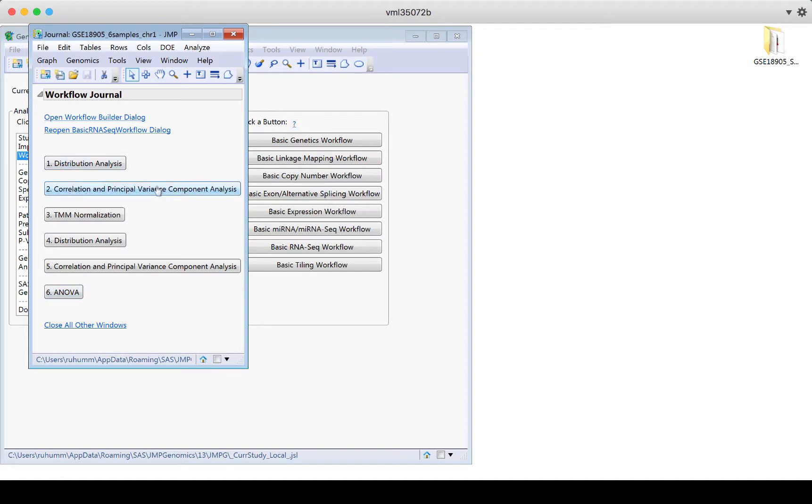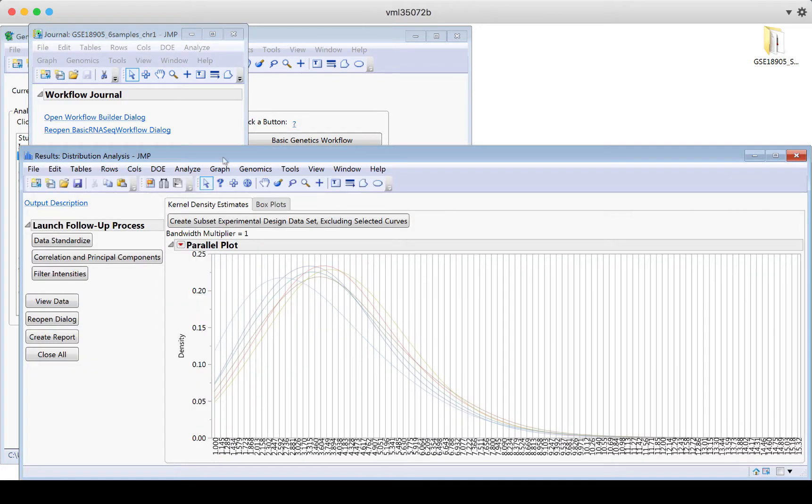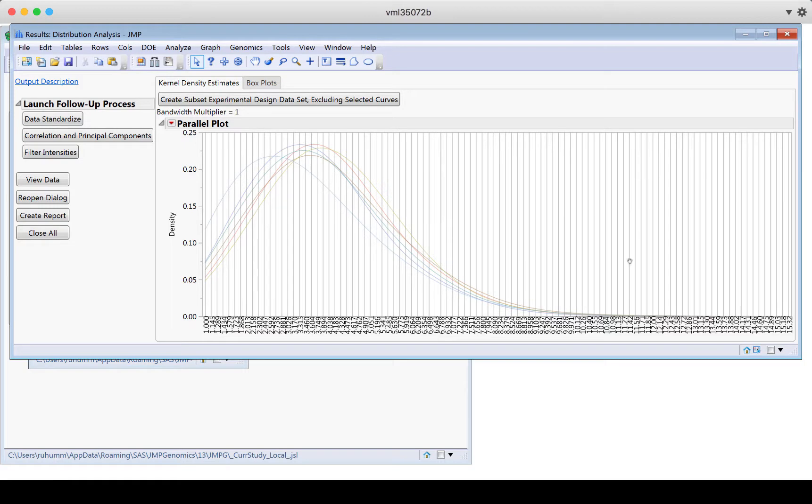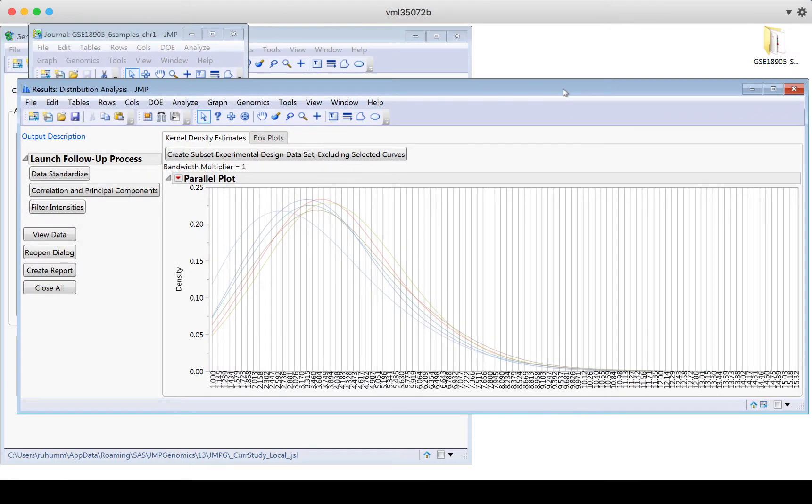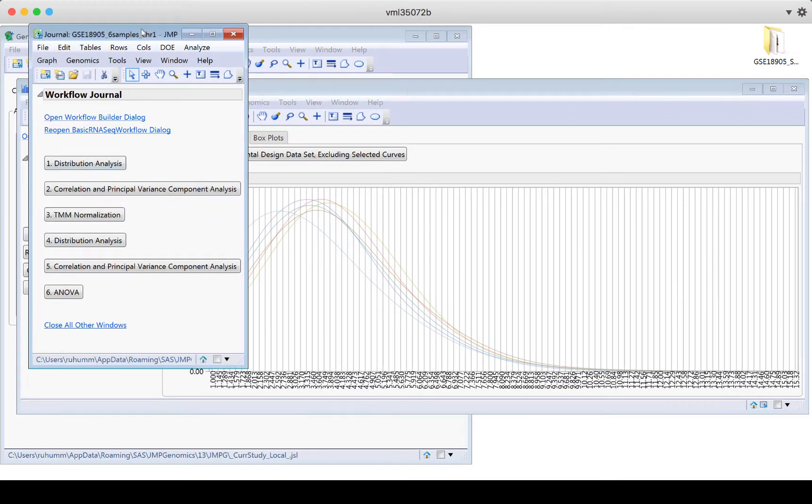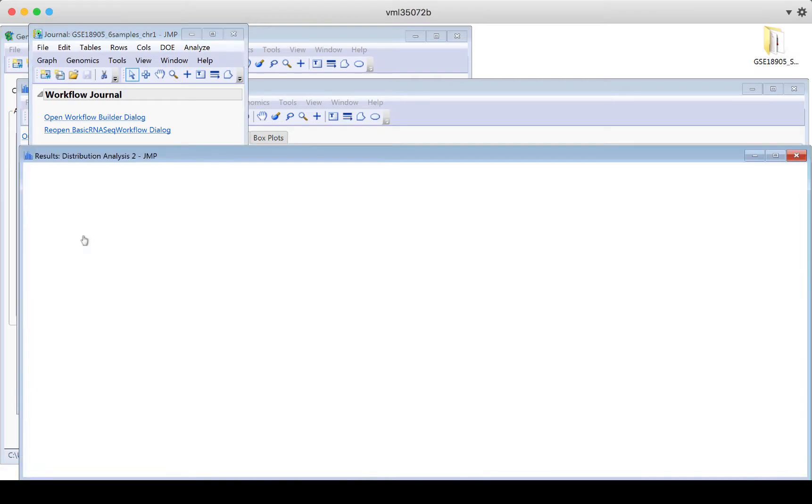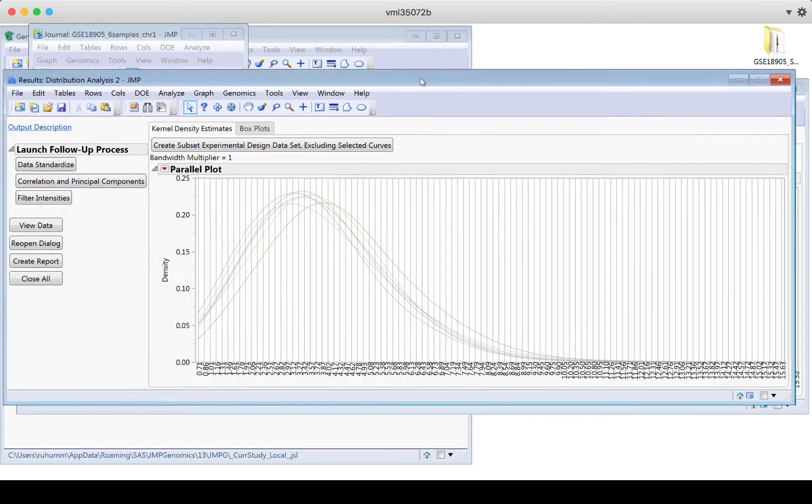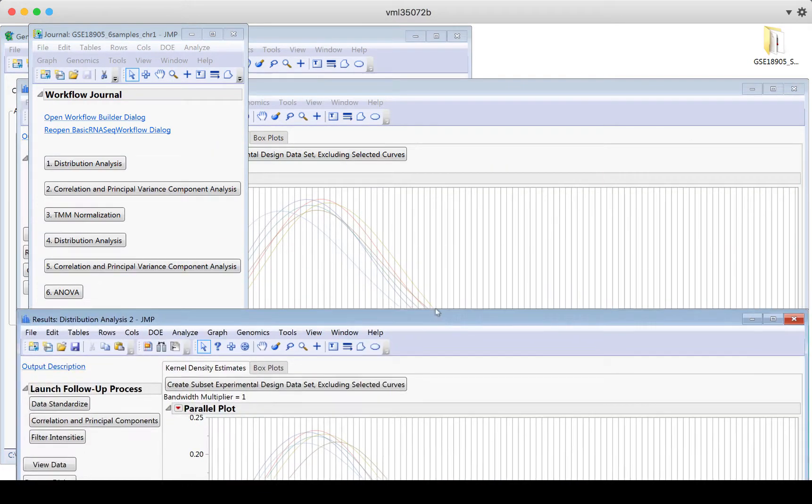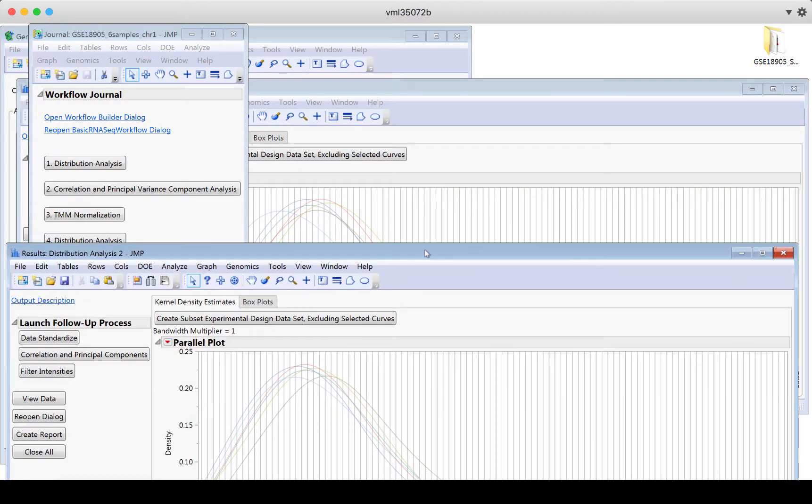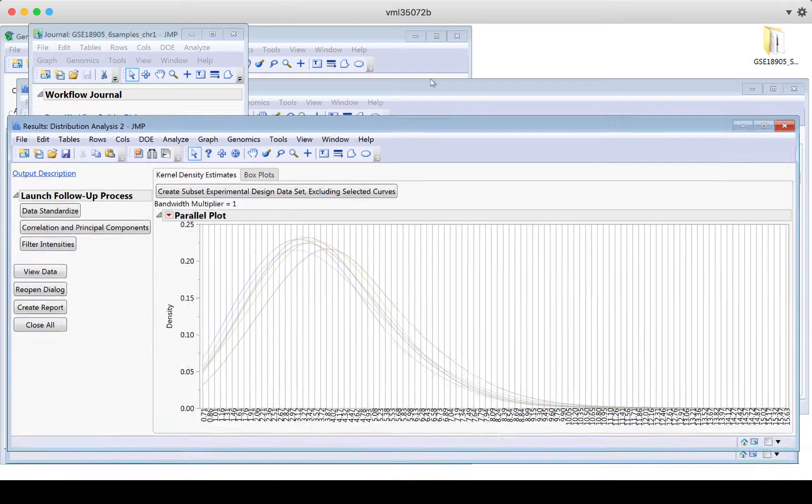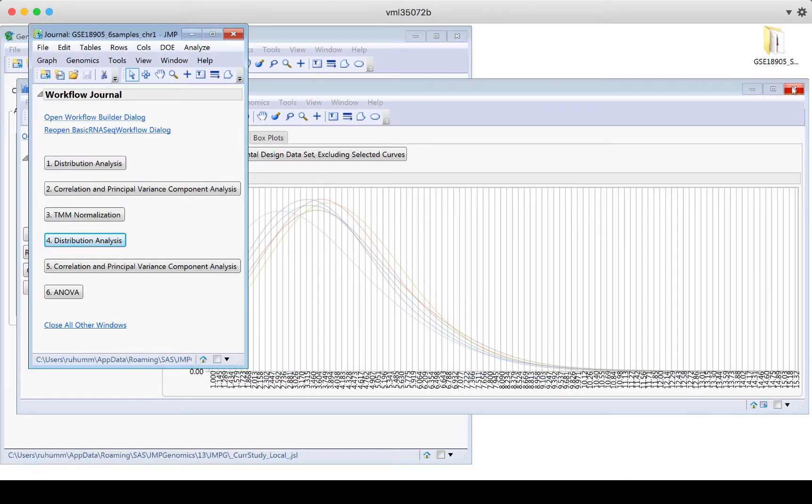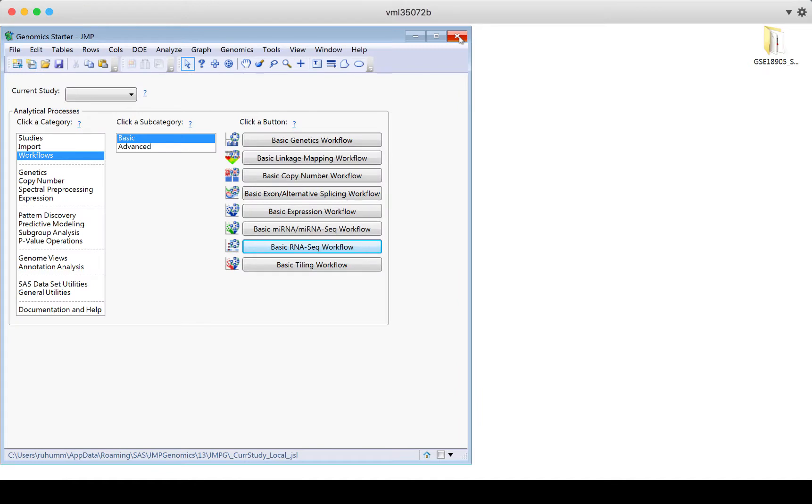And then here's my six things I asked it to do. I asked for a distribution analysis, correlation and principle variance components analysis, the TMM normalization. And then I said, and then do this stuff again after the normalization. So do it before and do it after, and then at the end and ANOVA. So I can click through these and look at the output. This was before normalization. If I click on the same thing after normalization, I see a little bit of a difference. They are more toward each other. And so I can go through these results.